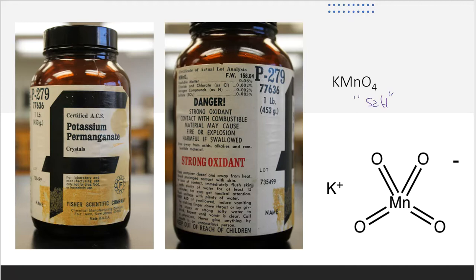If you need the manufacturer and the lot number, well, the manufacturer here is Fisher Scientific. You see that right there. And the lot number is over here to the side. It's 735499. Very old bottle. It's probably been here since the 80s. Still works. Still good.